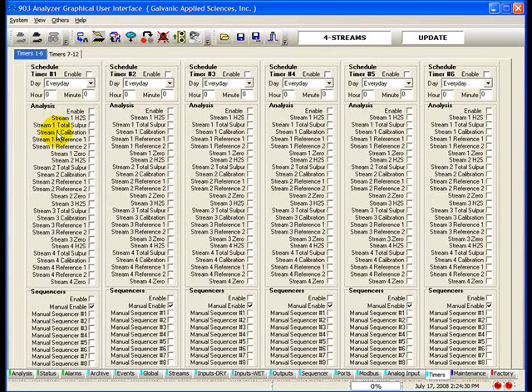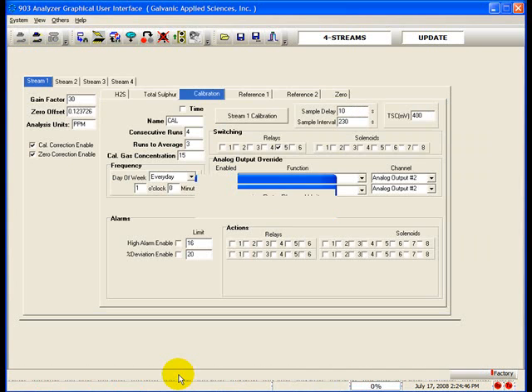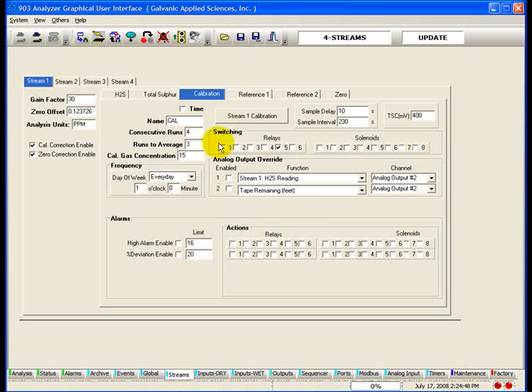Analysis timers are used to initiate a specific run at a desired time. When it's the designated time for the run to activate, selected runs will execute the number of consecutive runs as selected under the stream page. For example, if calibration run is selected, the number of consecutive runs is 4. Basically, the timer will initiate 4 calibration runs and then go back to the normal scheduler as configured under the Sequencer tab.